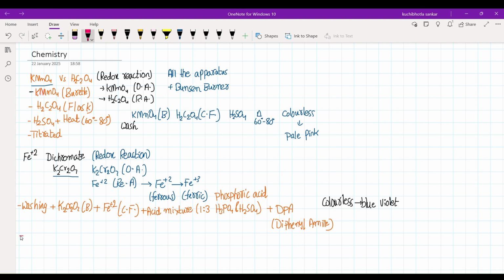Okay, so let's start. So alkalinity, and there are going to be two alkalinities here, partial and total. Let's look at all of those now. Okay, and for the principle you can write the principle of neutralization reaction.